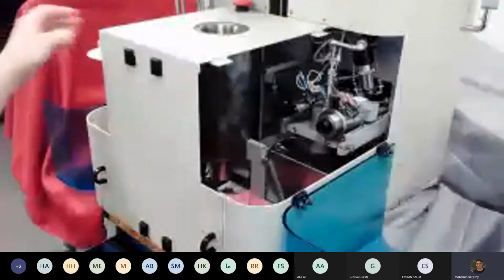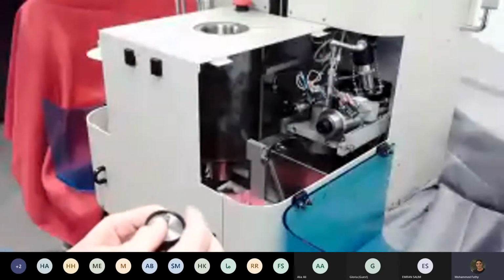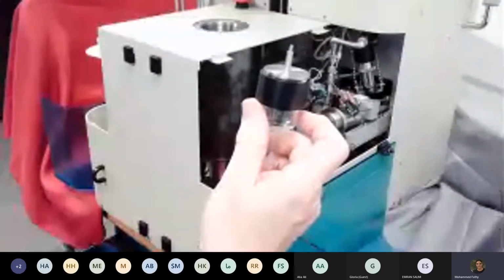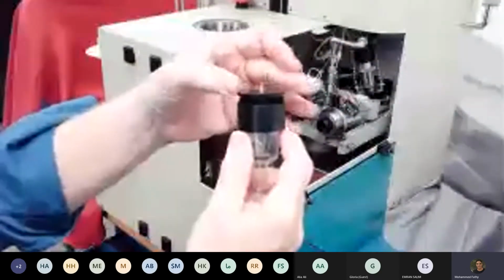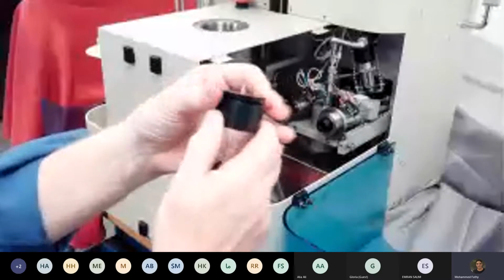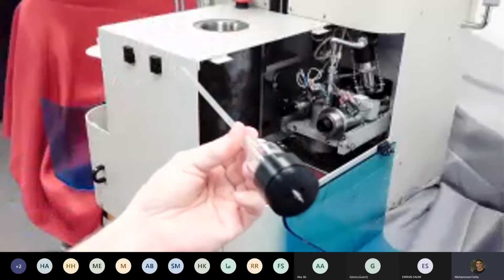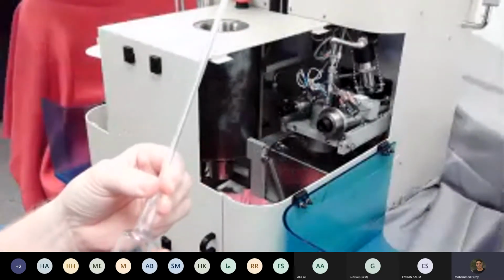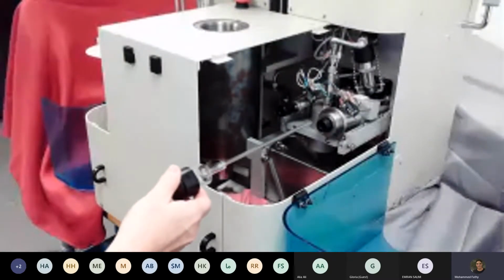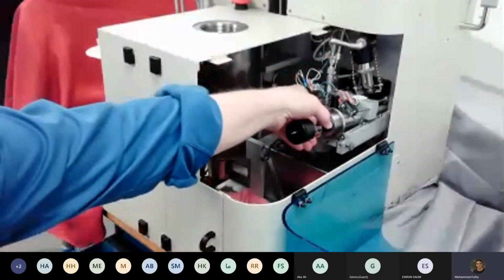And then to hold that in place, we have two plastic rings. So there's a plastic ring goes on the bottom, plastic ring goes on top. And this is simply just tightened down to hold that electrode in place. So that's what we call a penetrometer assembly now, sample inside, and that's going to go into the low pressure side of the instrument. It's going to be simply inserted like that. It's going to be tightened up.